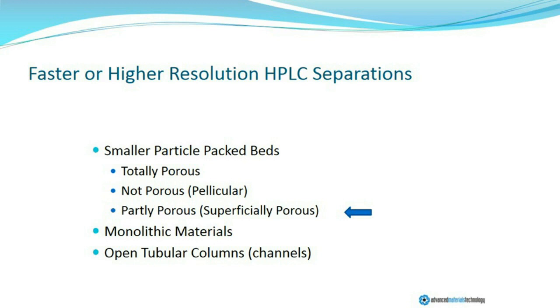Now, such packed beds can be formed in a number of ways. They can be formed from totally porous particles, also referred to as fully porous particles, those which have no pore structure, or nonporous materials, and the partly porous materials. And this is where we'll focus most of today's attention, on these partly porous or so-called superficially porous particle packed beds.